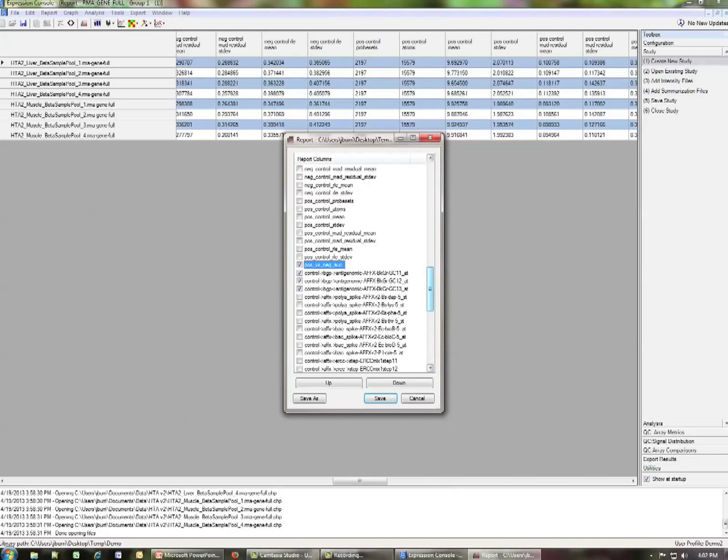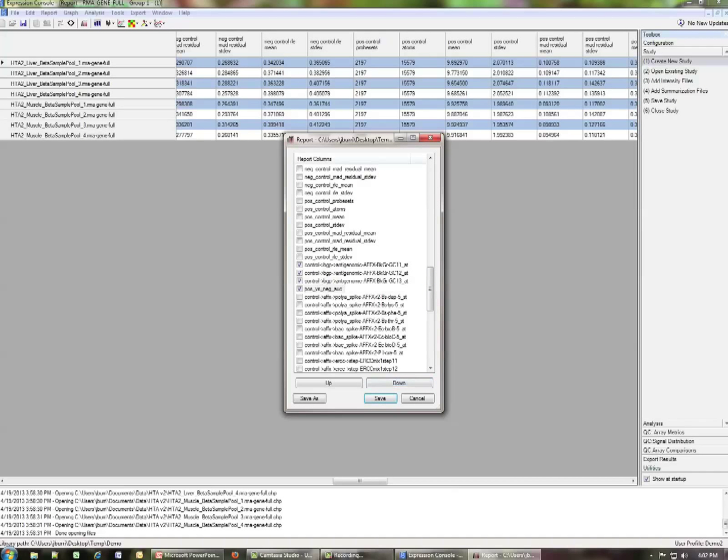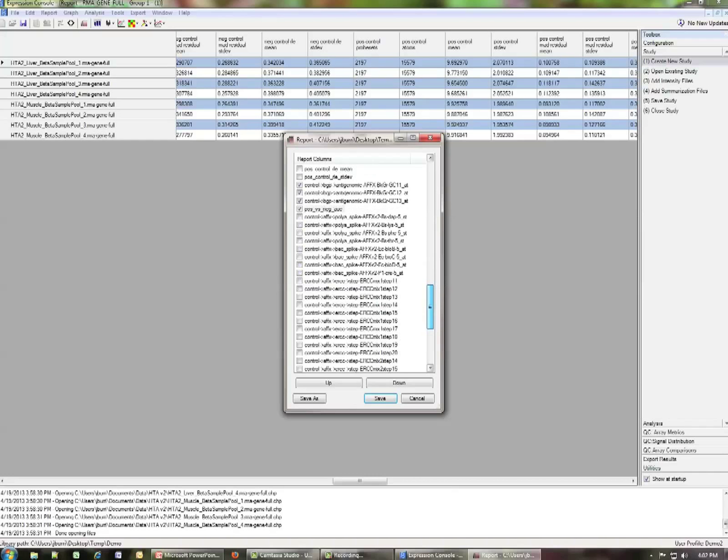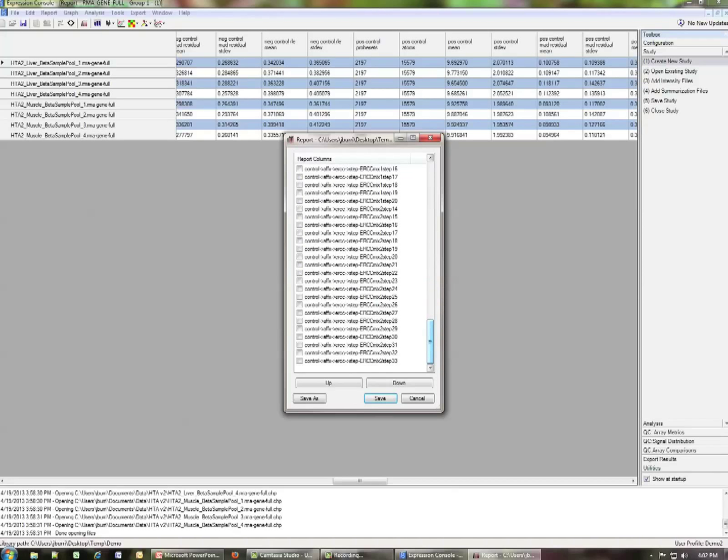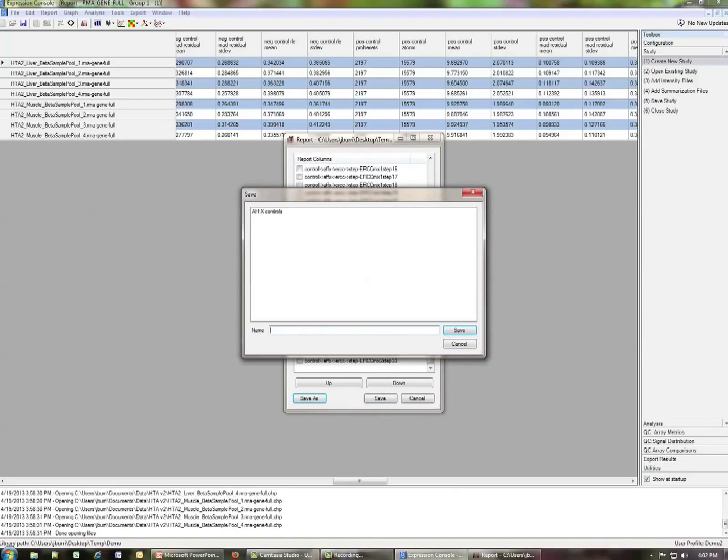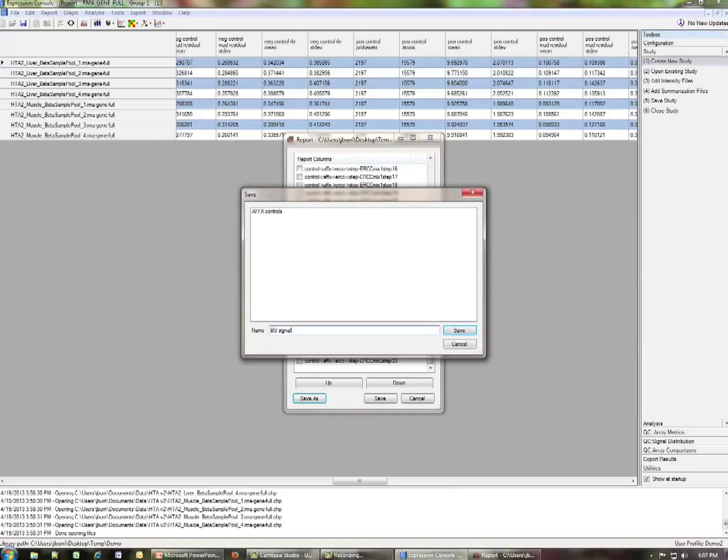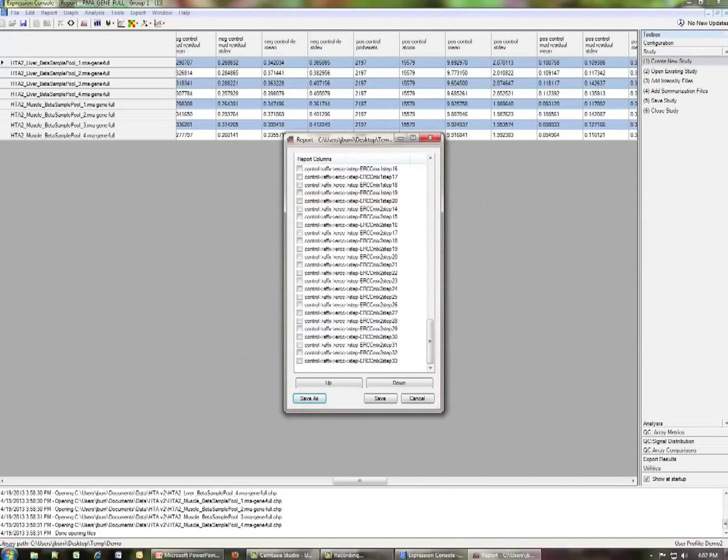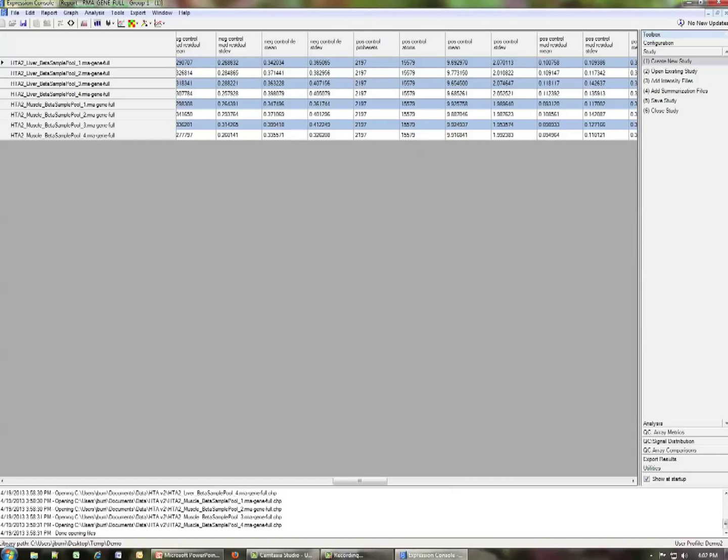And I'm going to go ahead and add one more which is the positive versus negative AUC. And I'm going to highlight that guy. And because he's not related to the backgrounds, I'm going to move him down so it's possible to customize the order of the things that show up. And we're going to go save as and for this one, BG signal. Now we'll hit cancel and close that.